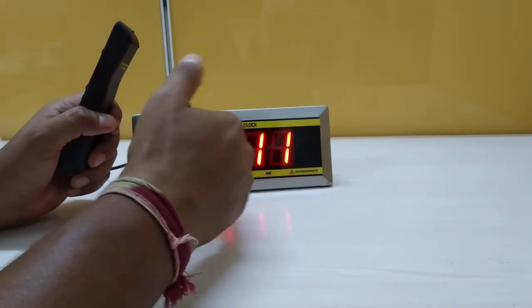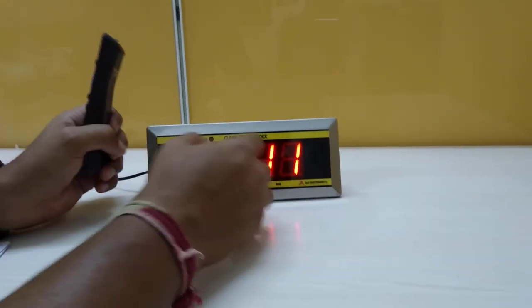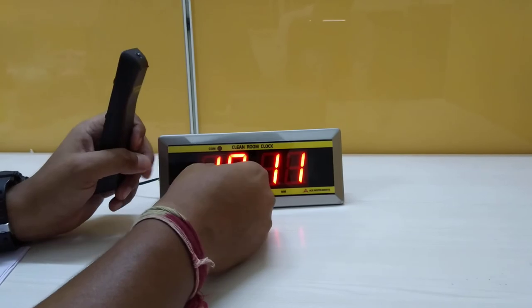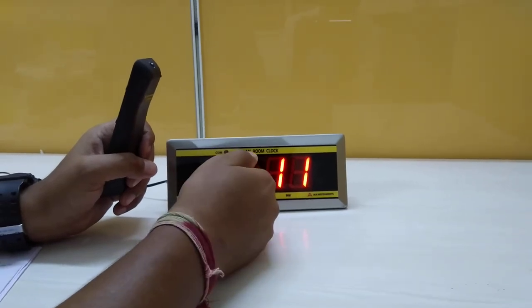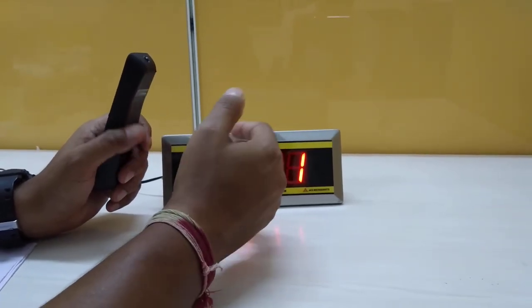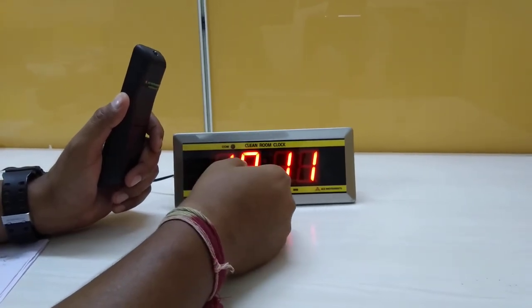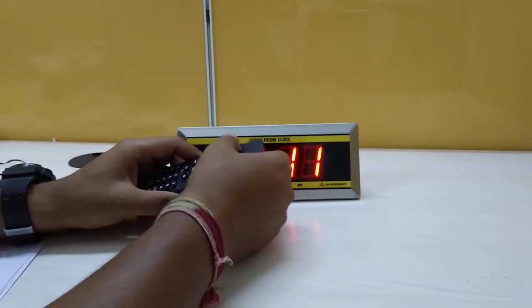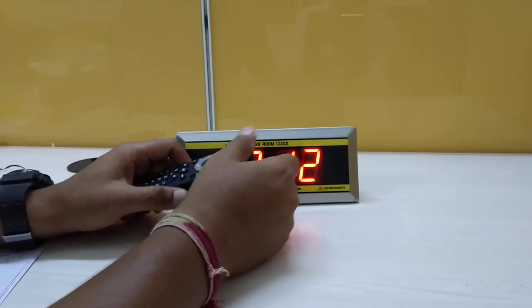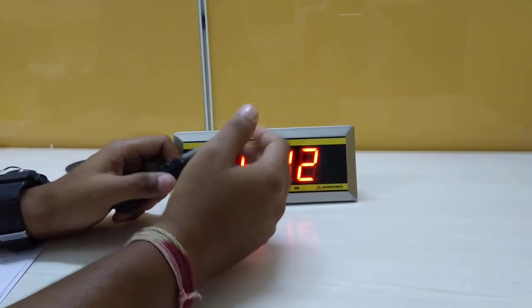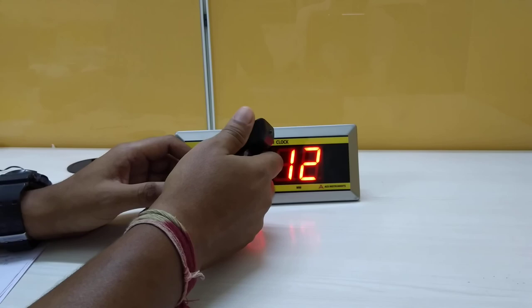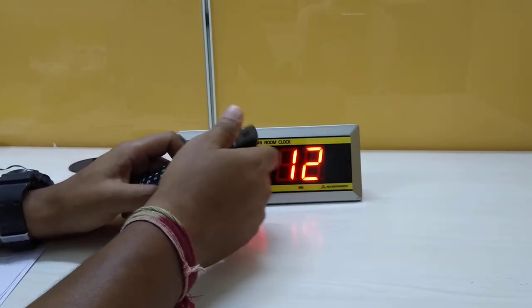These clocks also come in flame proof model or intrinsically safe model if required in some flame proof areas. For more information on the clocks, you can go to www.instrucart.com. Thank you.